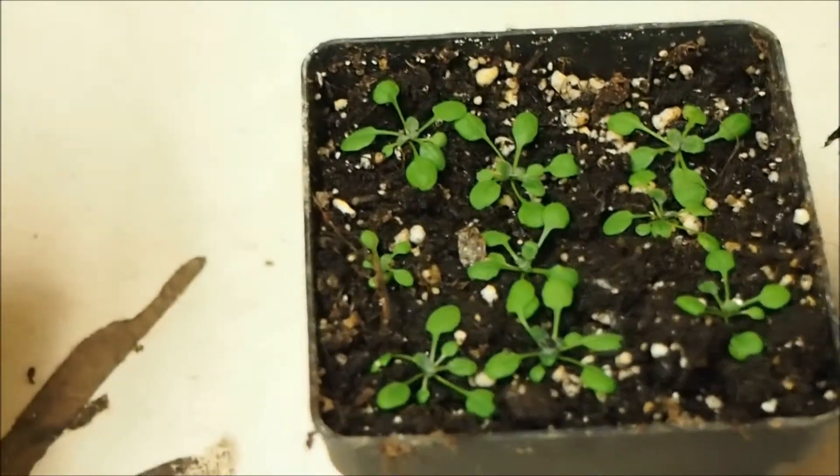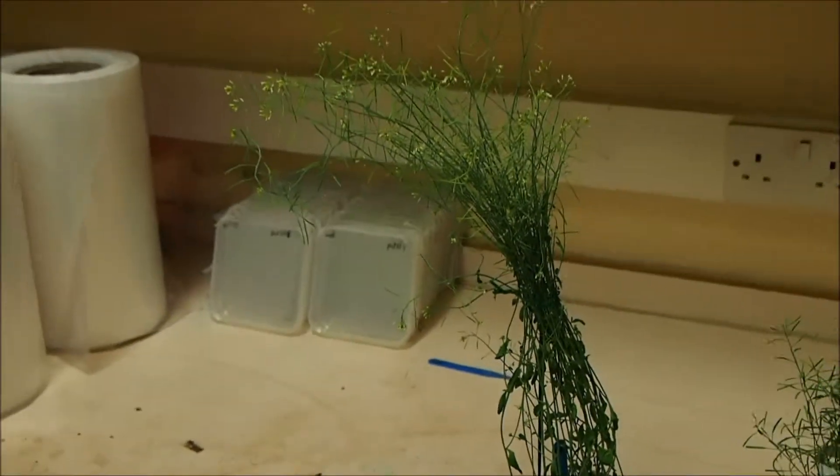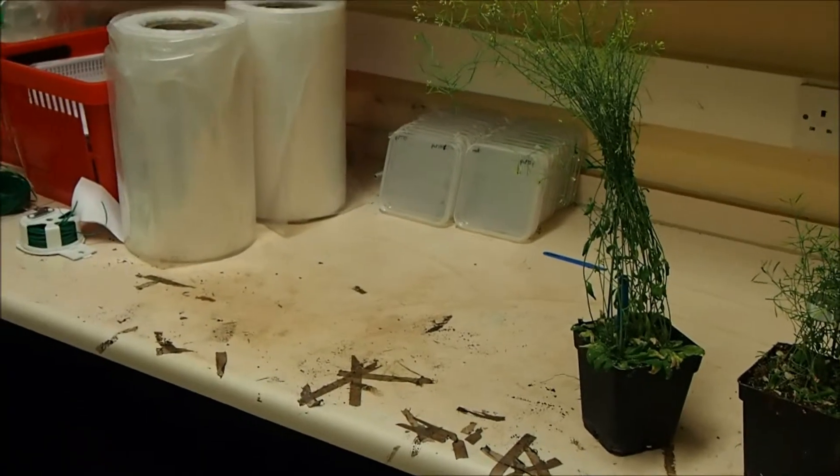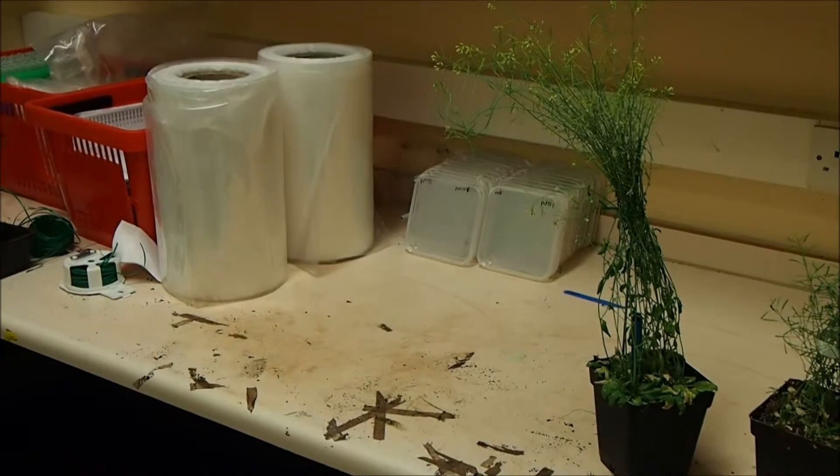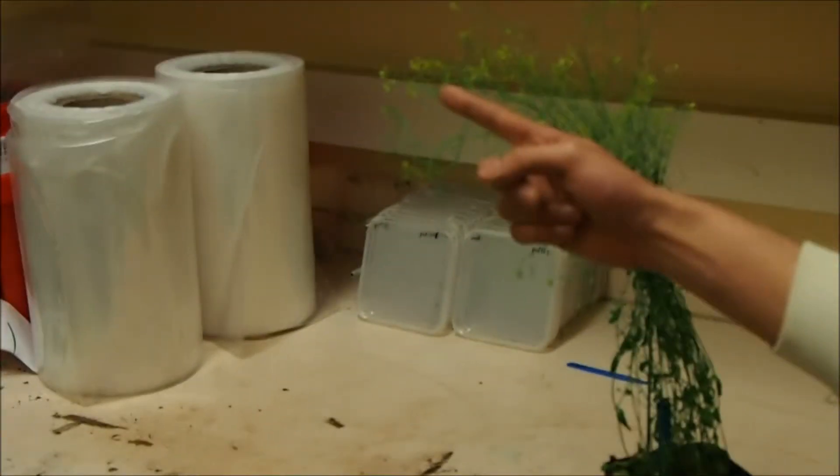Okay, and then next we're going to show the two-month-old Arabidopsis, which looks like this. As you can see, it's quite tall for a weed. It's got stems, some flowers as well as you can see there, and some siliques, which is where the seeds form and that's how we harvest it.